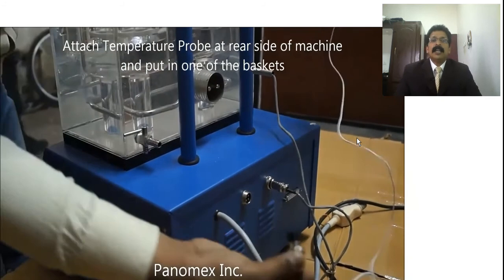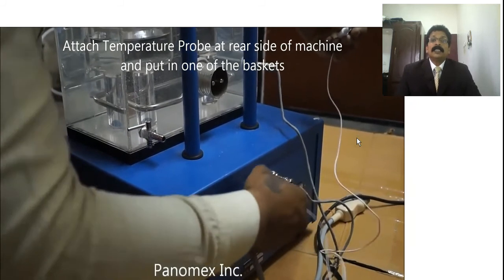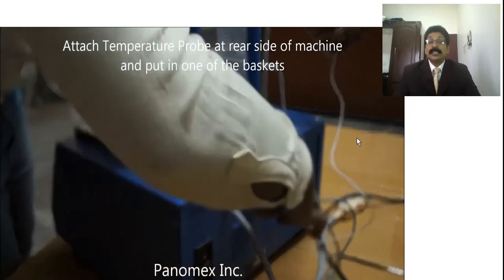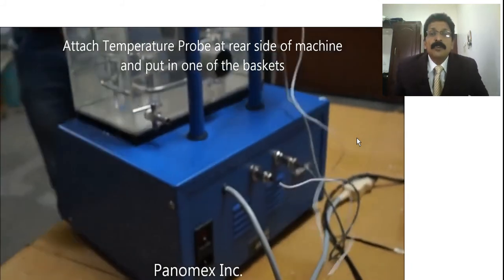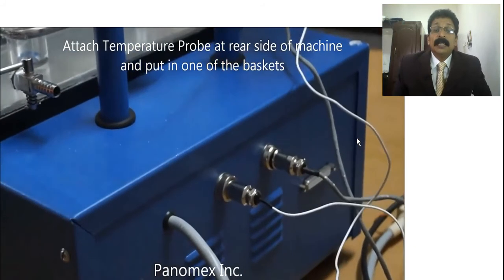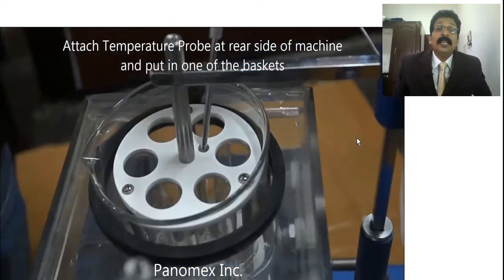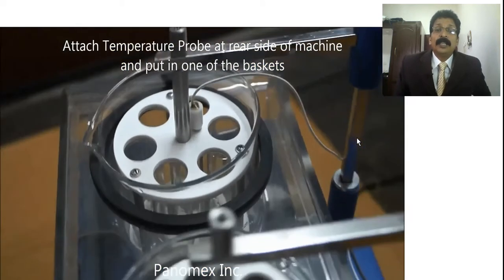And then we take one thermometer, that is a temperature probe, at the side of the machine, and you have to fix it. There is an electrode which should be kept inside the beaker near any one of the six chambers. There is a holder and it will be kept there, so that it will give the temperature.